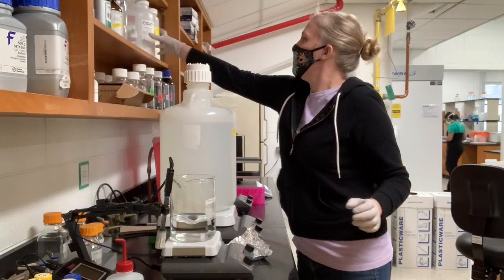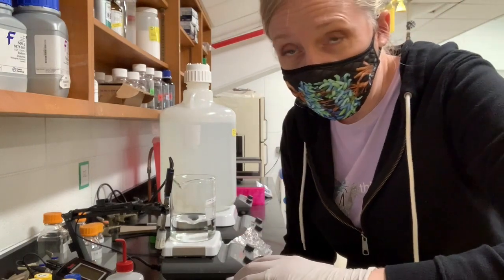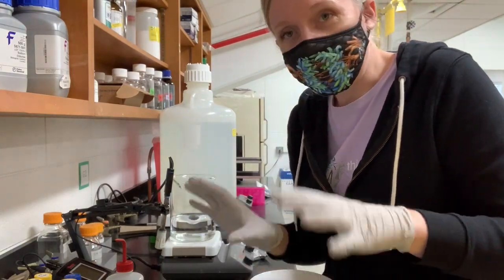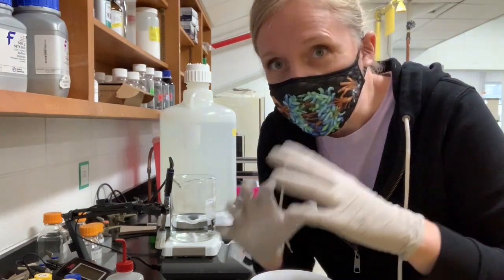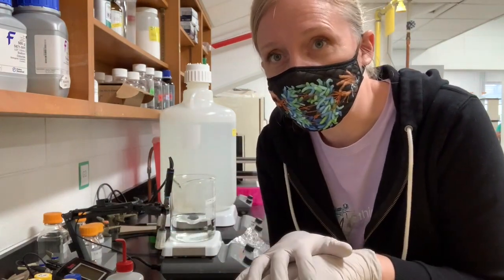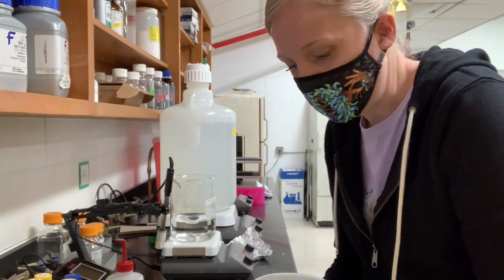We have a really big container of sodium chloride. If you see that it has little chunks in it, you can shake it up. Some people like to use spatulas. My postdoctoral advisor hated spatulas because he always worried about contamination of one chemical to another, and that was how I was trained more recently. There are some spatulas in the glassware cabinet. If you find that is easier for you, just make sure it gets washed after each use.